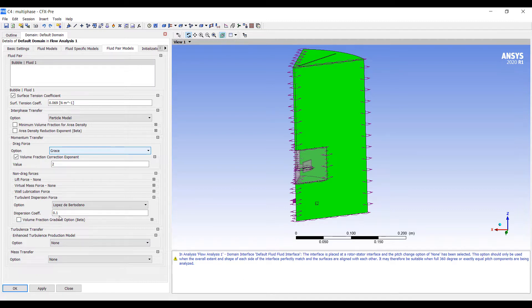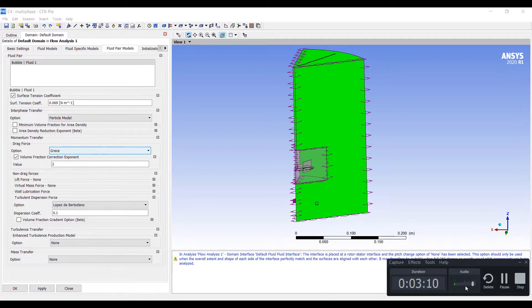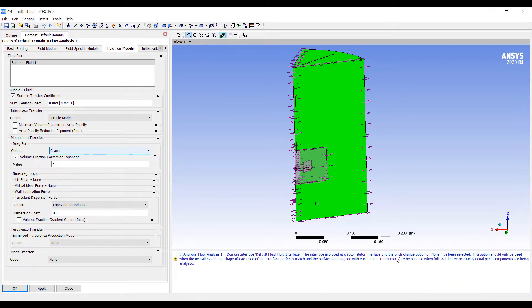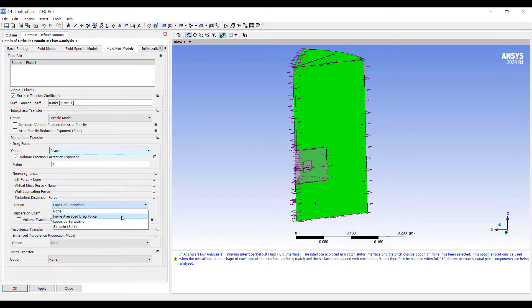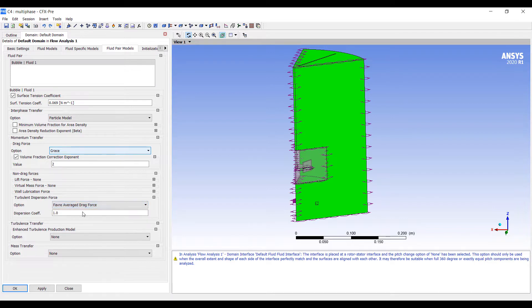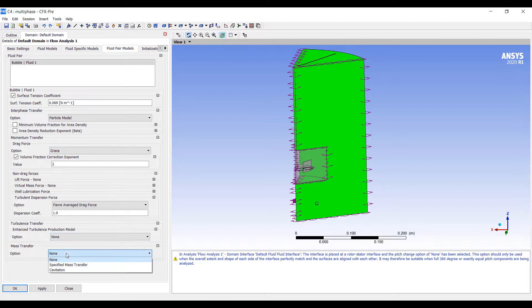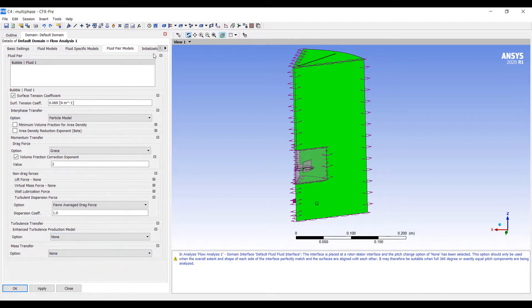This will cause flow to be dispersed. Actually, we should be using Favre average drag force of 1. And we can turn on mass transfer, write an equation for the mass transfer, but in this model, we'll skip that for now.